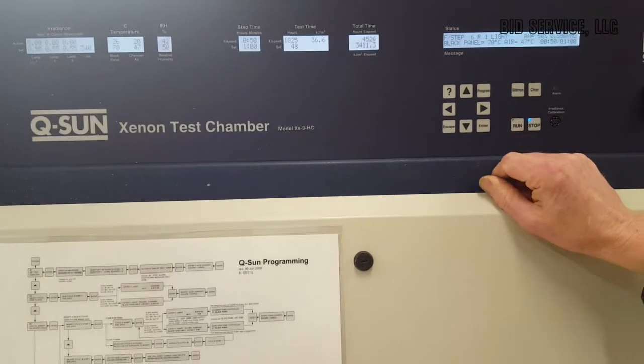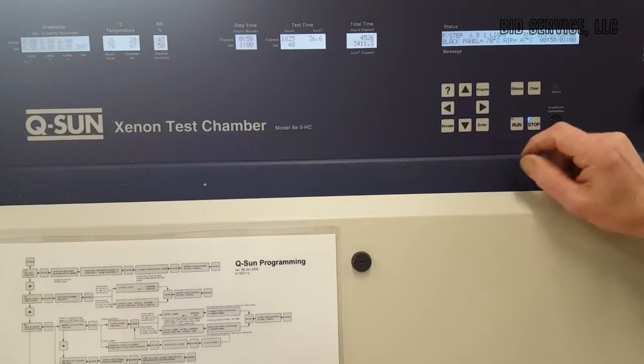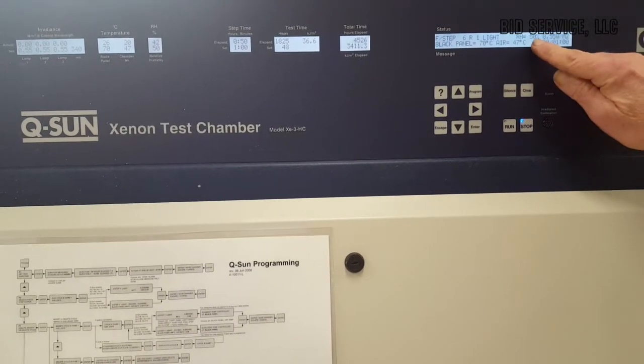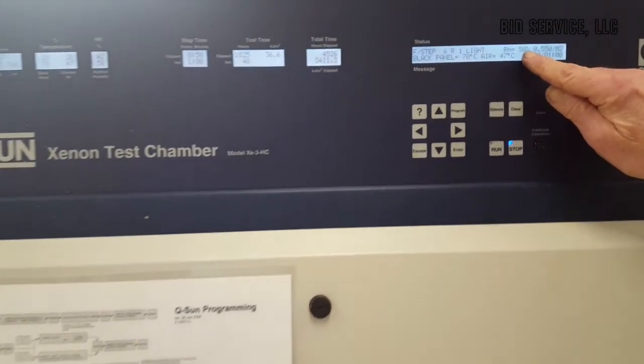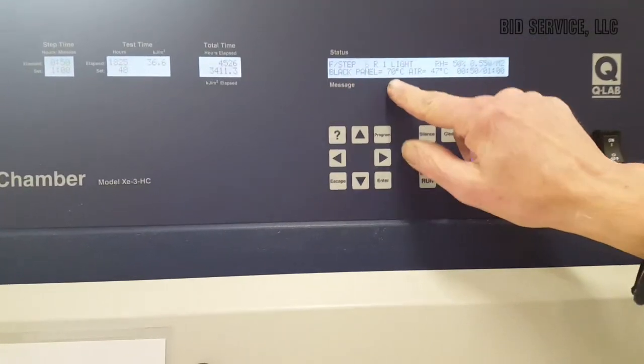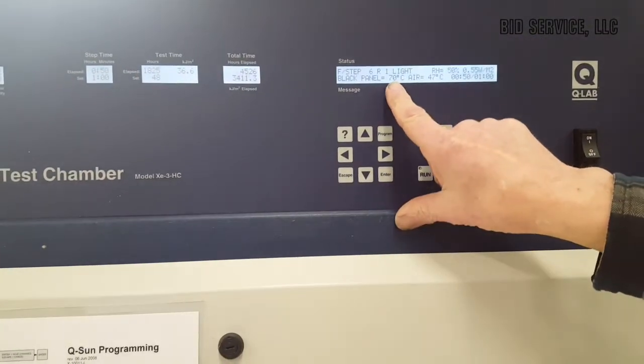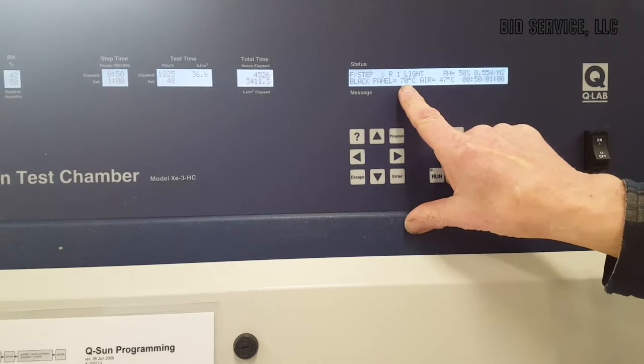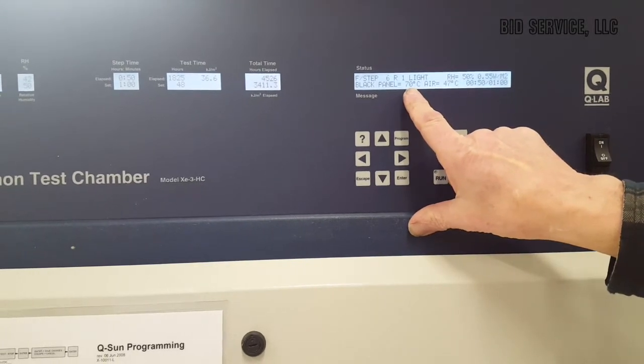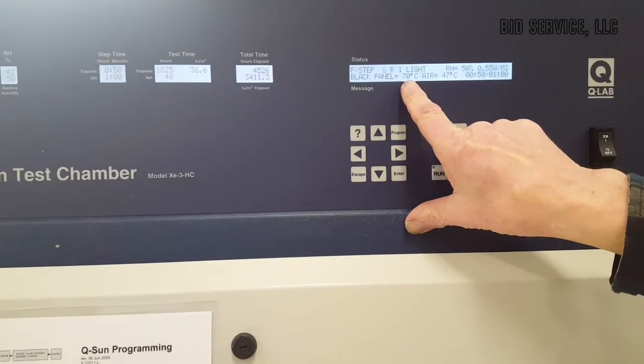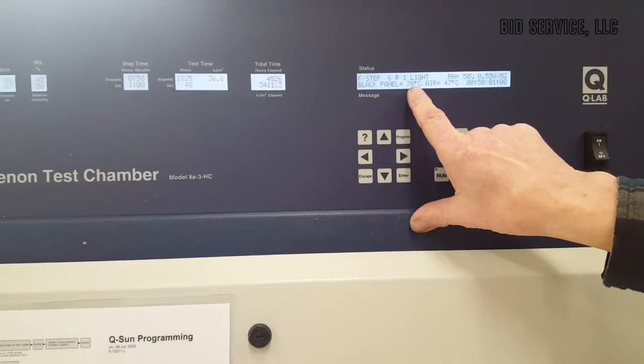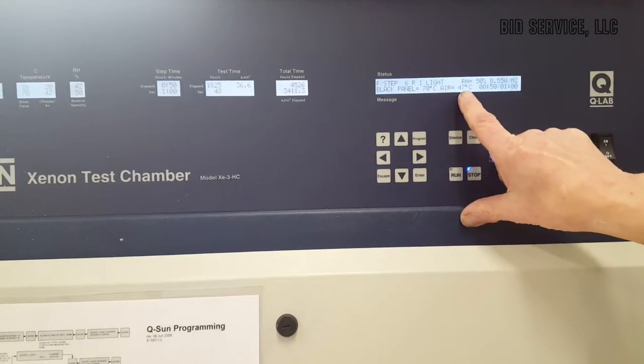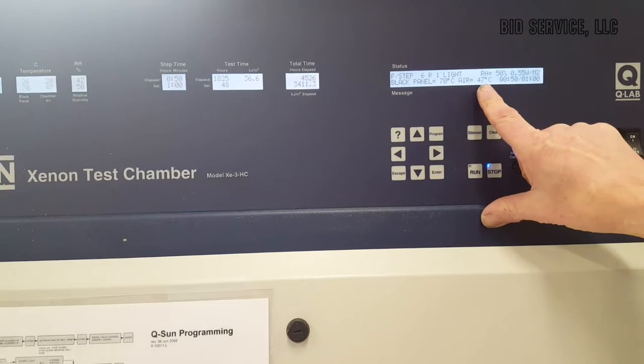What that will do is it will set the relative humidity to 50 percent, and the black panel temperature in the back, or the tray temperature where your specimens would be on, will be set at 70 degrees C, and the actual surrounding air temperature will be at 47.